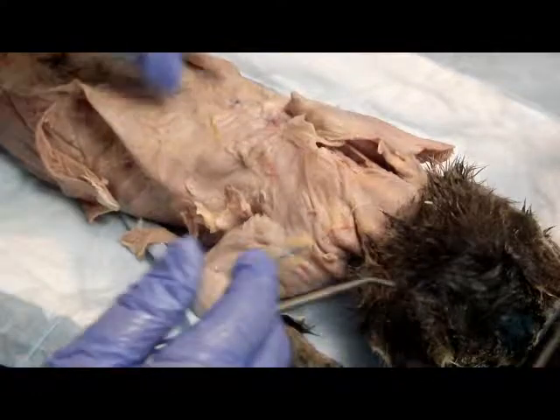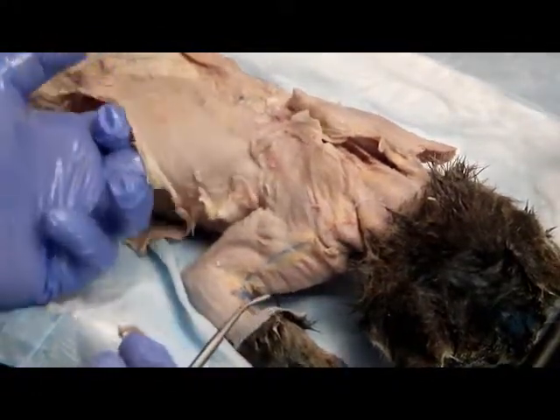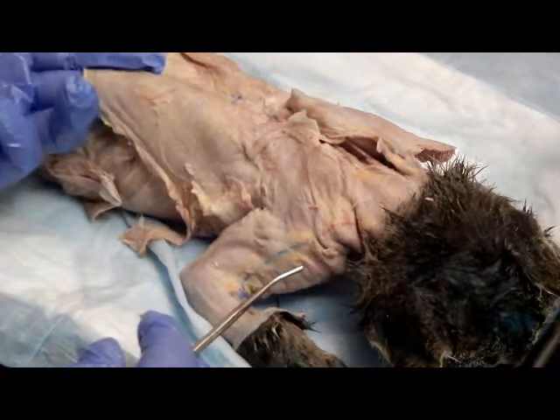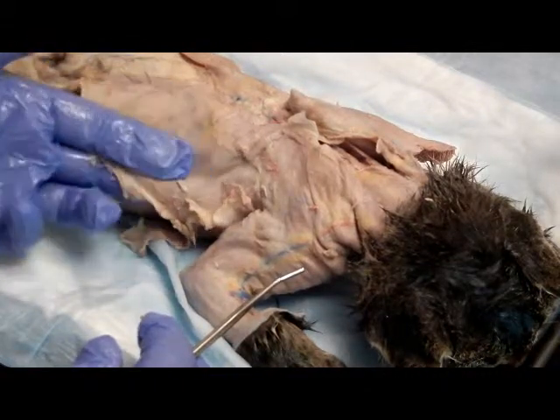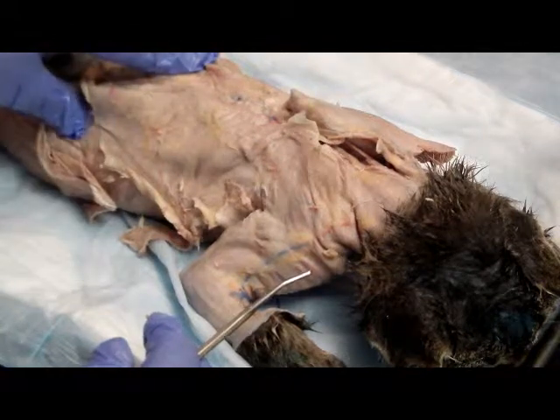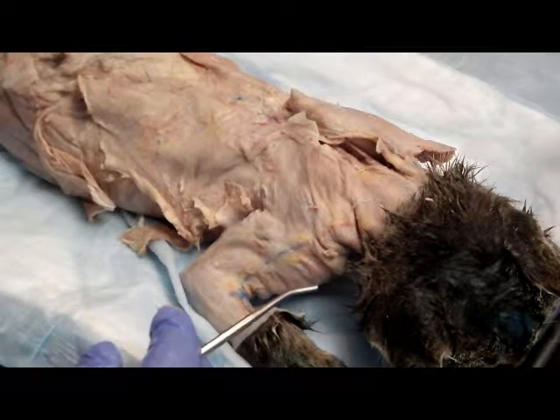The spinotrapezius. Its origin is the spines of the thoracic vertebrae, and its insertion is the fascia of the scapula. It draws the scapula dorsad and caudad, which is inferiorly and down.